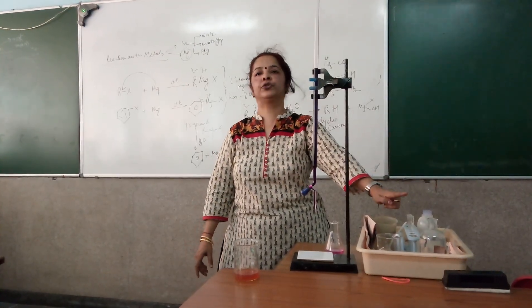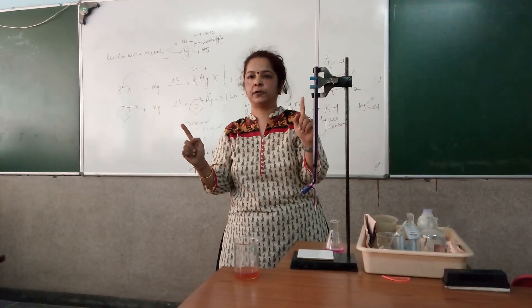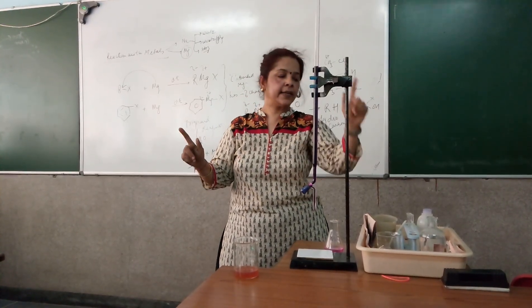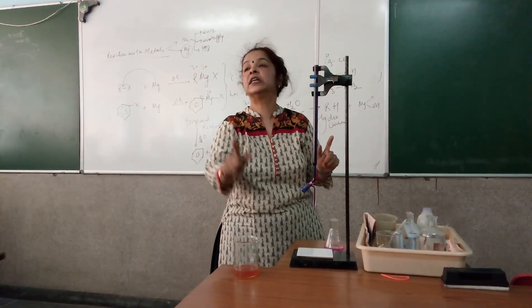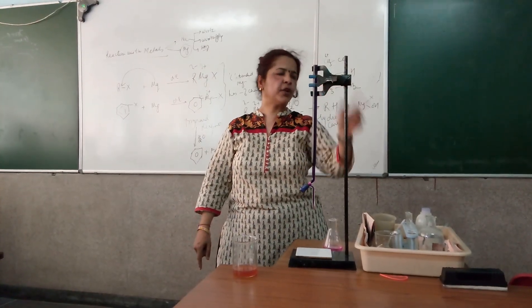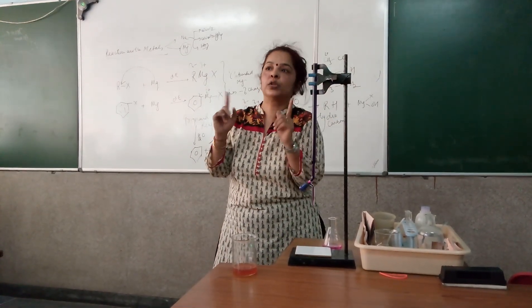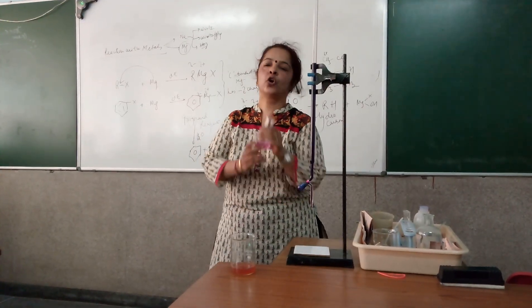The sulfuric acid provided to you should be of a strength that it can sustain acidity over the period of titration. At times it happens that despite using one test tube full of dilute sulfuric acid, it is still turning brown. There could be two reasons: one, the strength of the sulfuric acid is not up to the required level, or else you did not wash your conical flask.